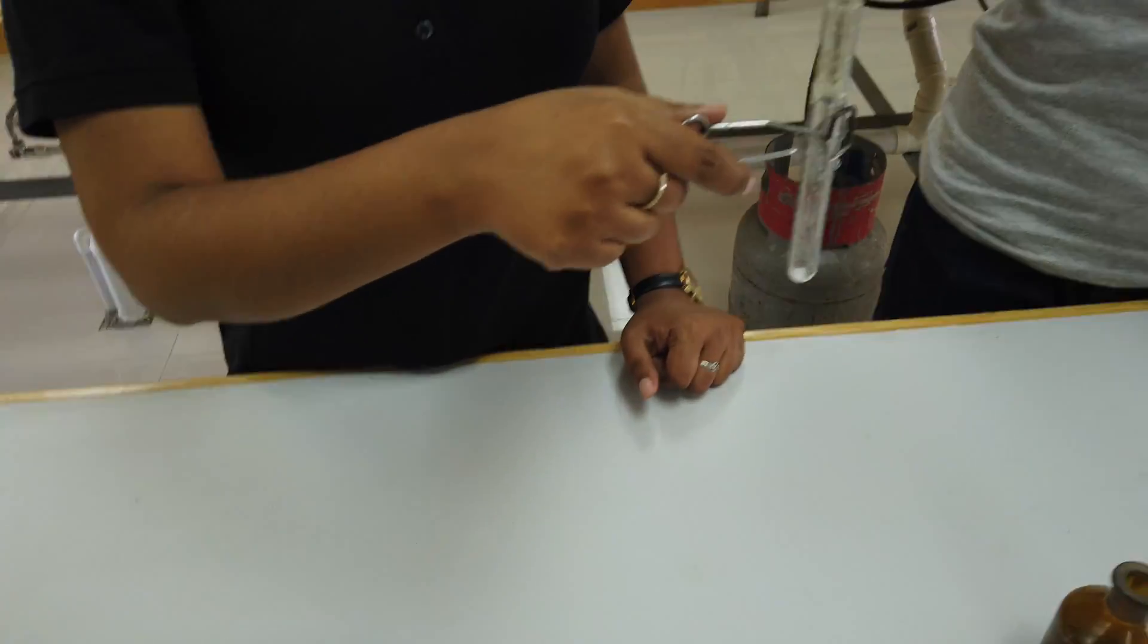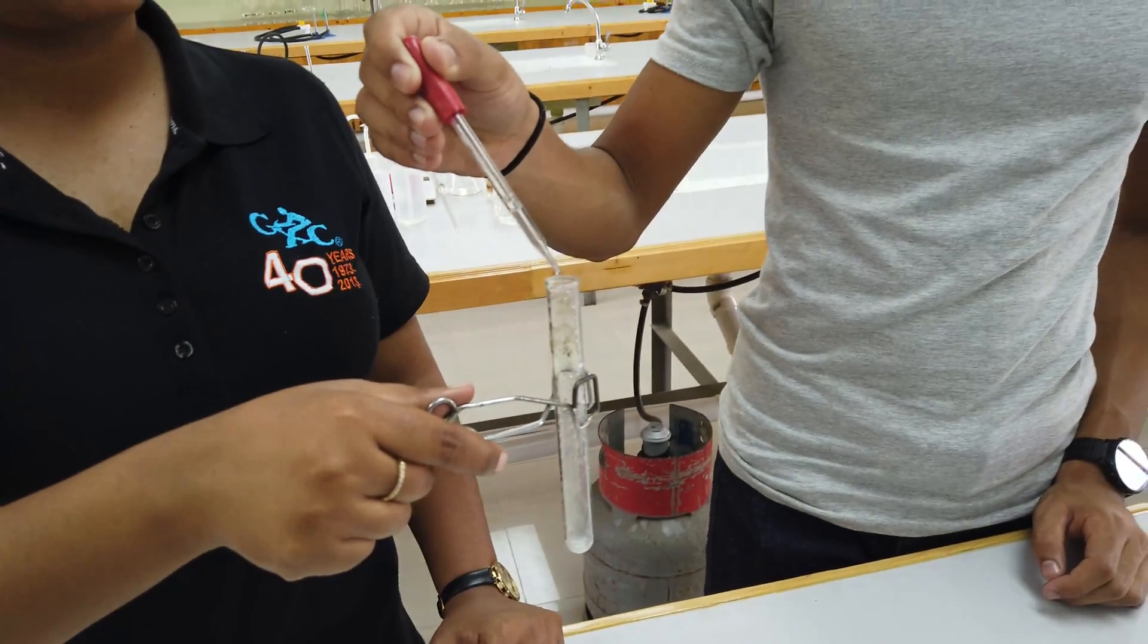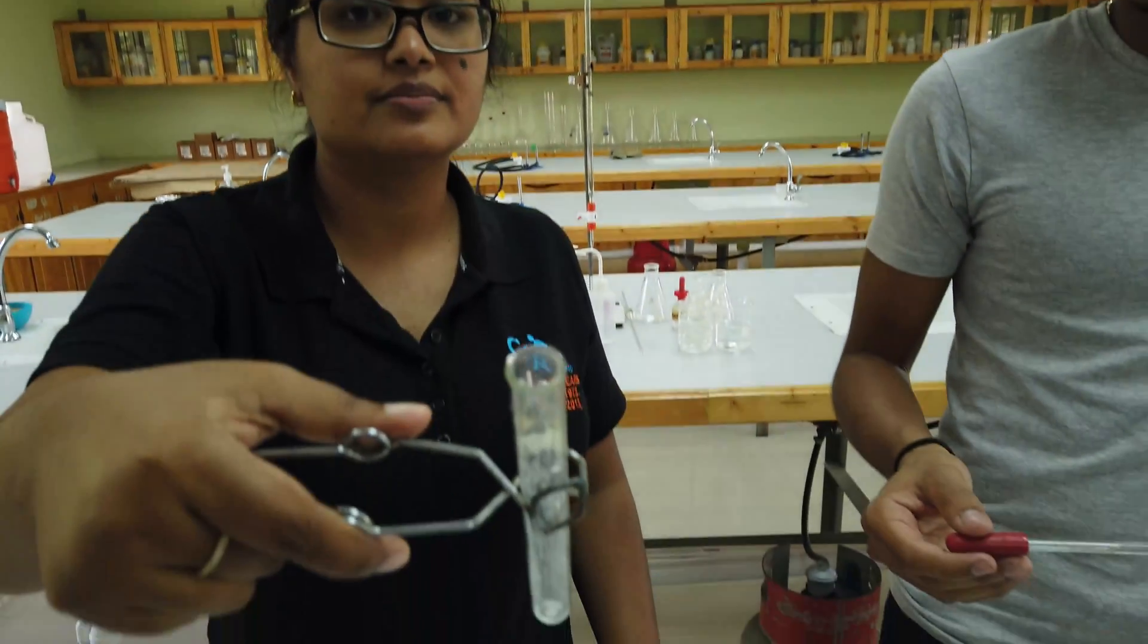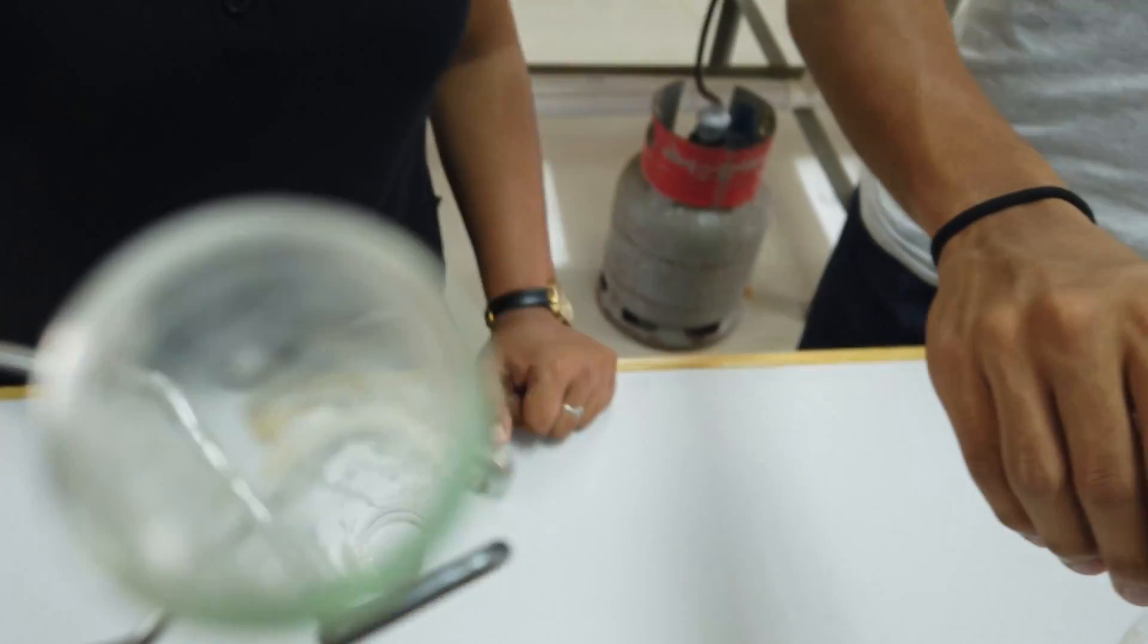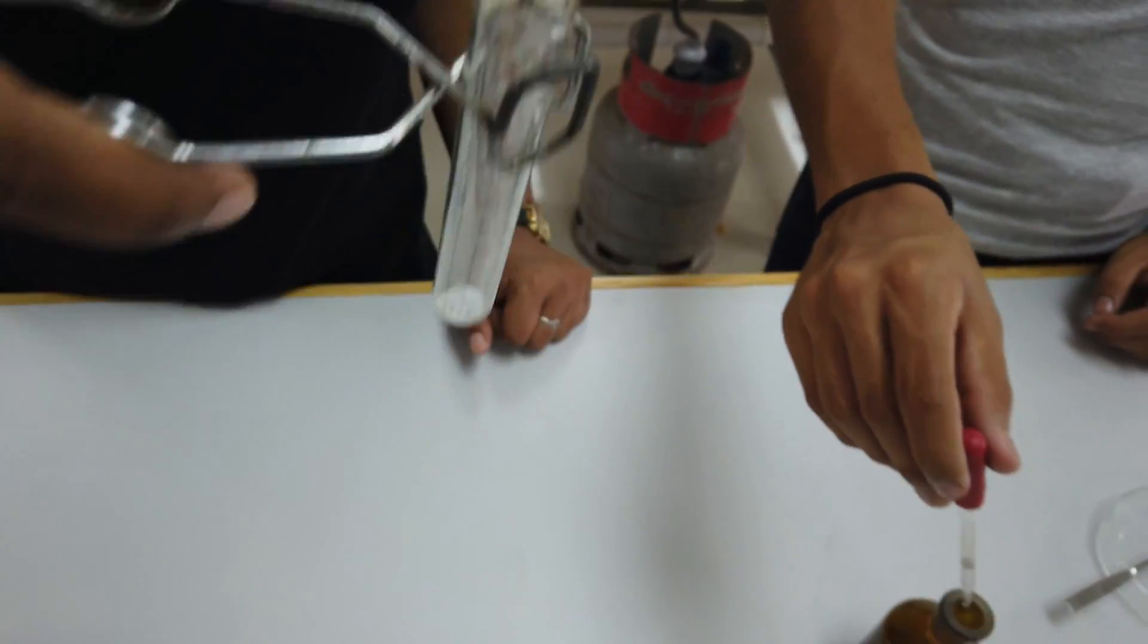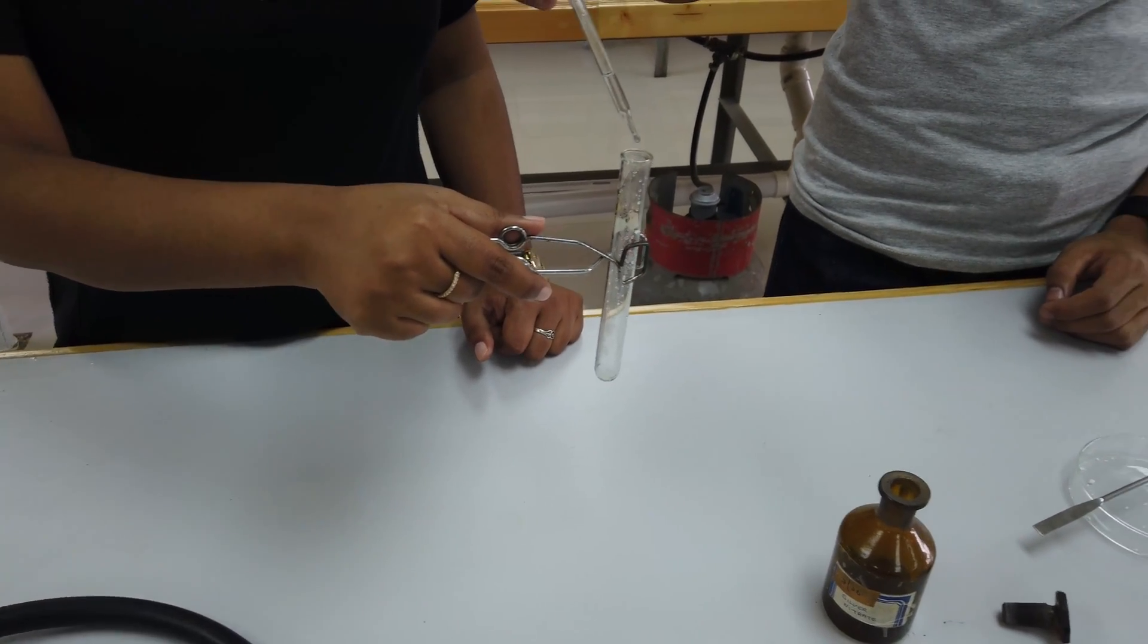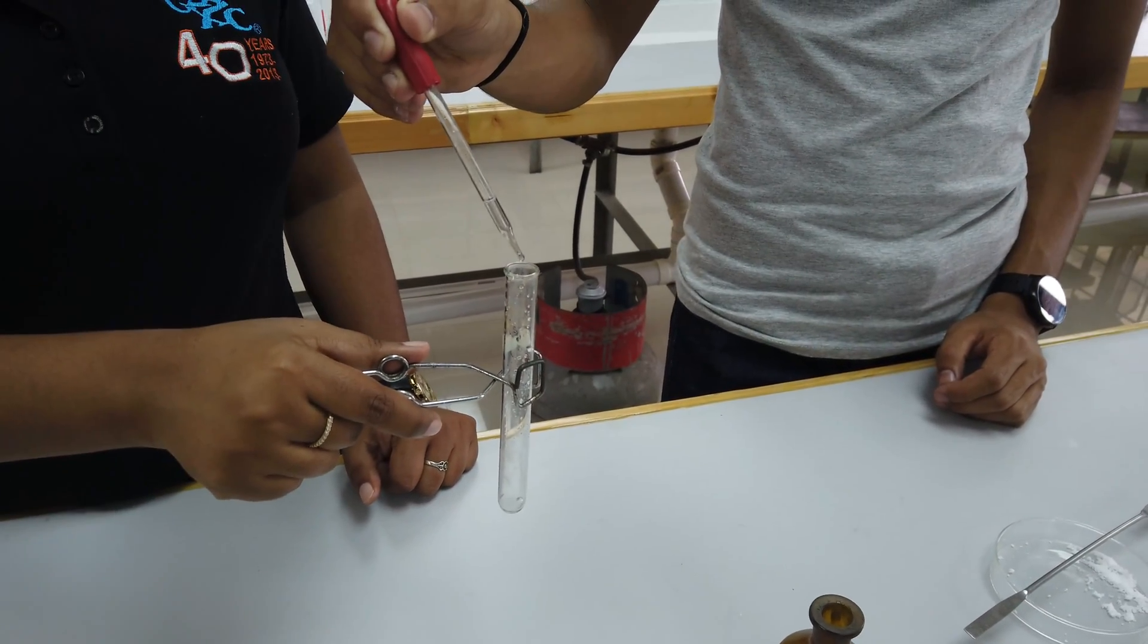If you look at the bottom of the test tube - the salt sample seems to be dissolving. We can see the solution is colorless. Because no precipitate has been formed, it really means no chloride, bromide, or iodide ions are present.